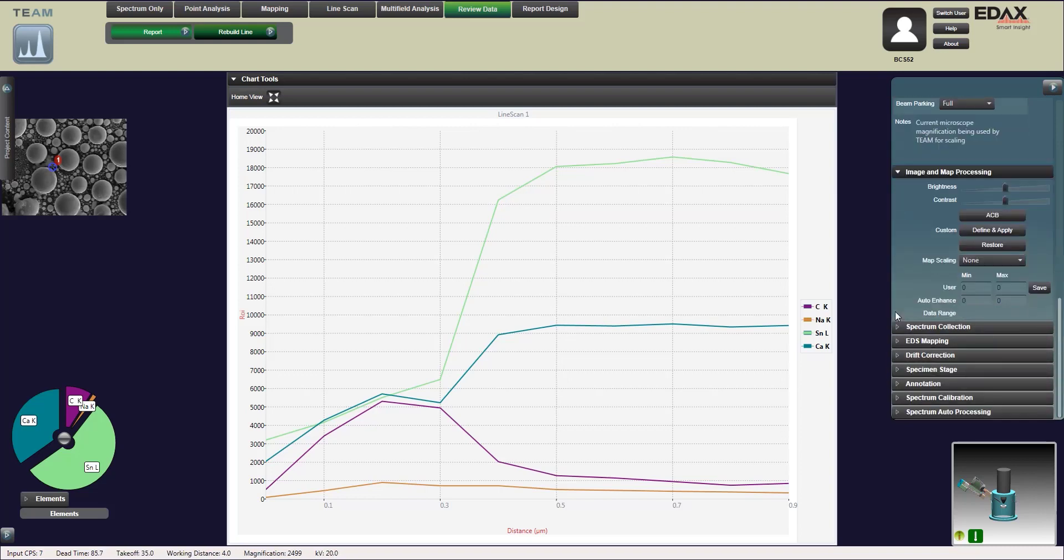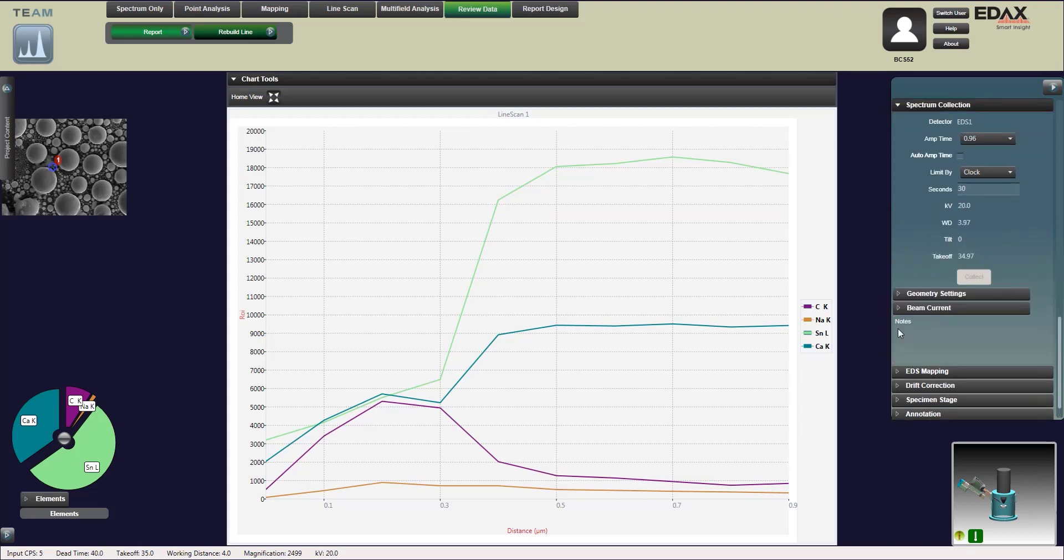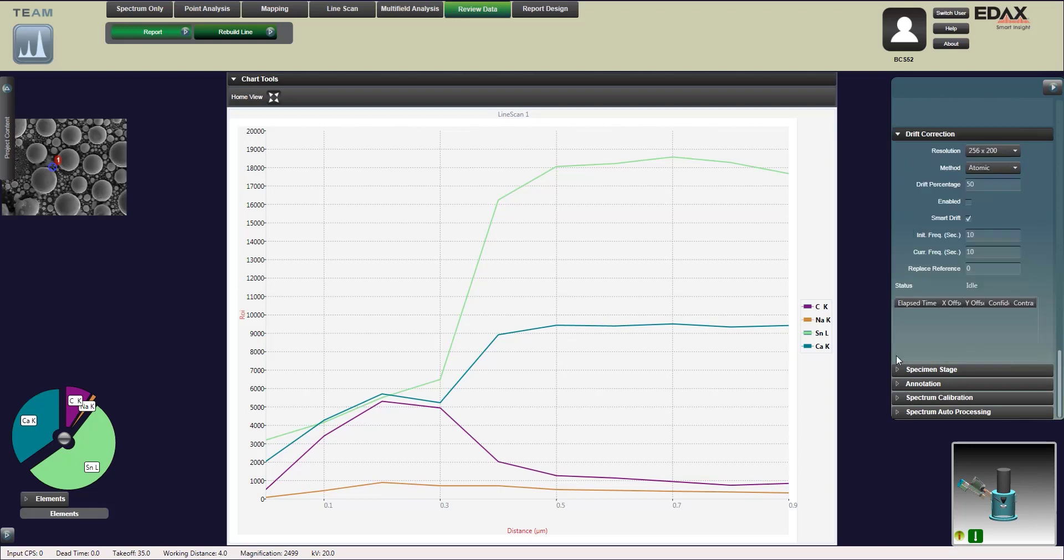Then options for some mapping drift correction, specimen stage, and so forth.